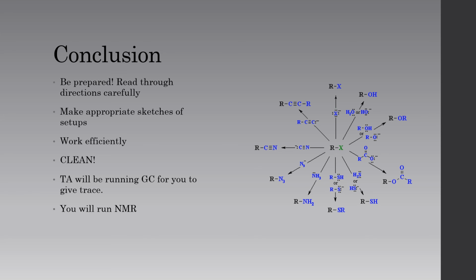So along with that, make sure you have the appropriate sketches of your setups, right? Know what you're doing before you come in here. Spend your time doing it properly. Work efficiently. There's quite a few experiments and setups that you need to do, so plan your time wisely before you come in, otherwise you might run out of time. As with all things, but especially here, keep your area and your glassware clean. Spend some time cleaning your glassware before you start, otherwise, again, you're going to throw off your results.